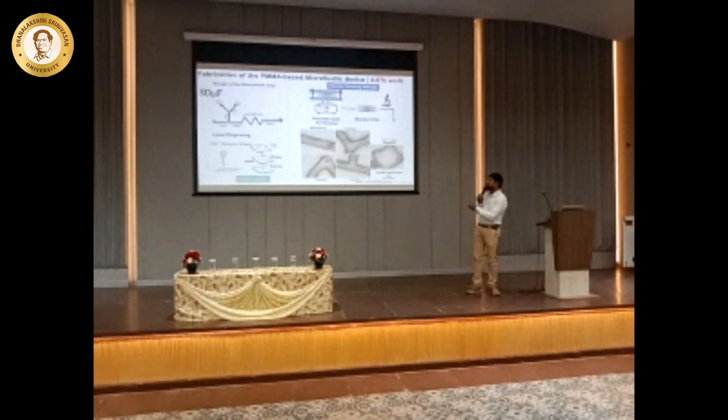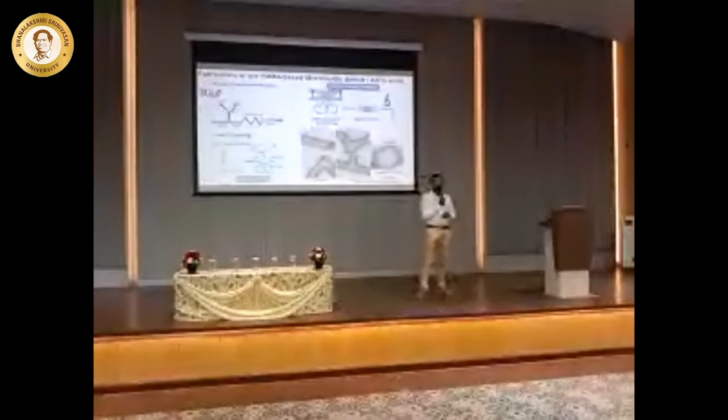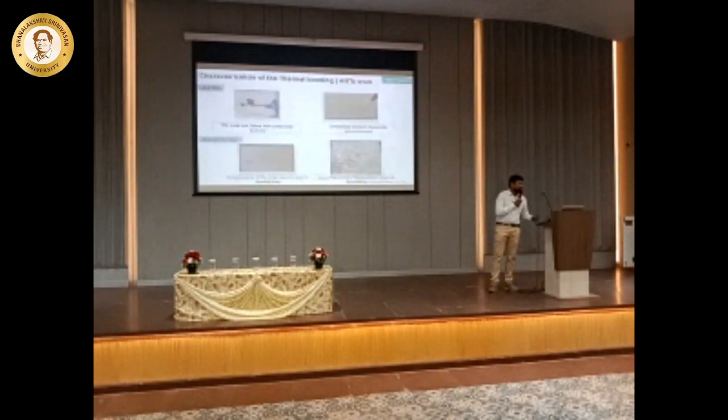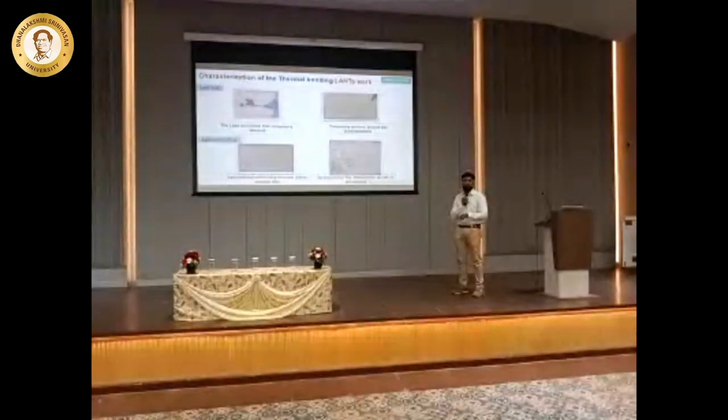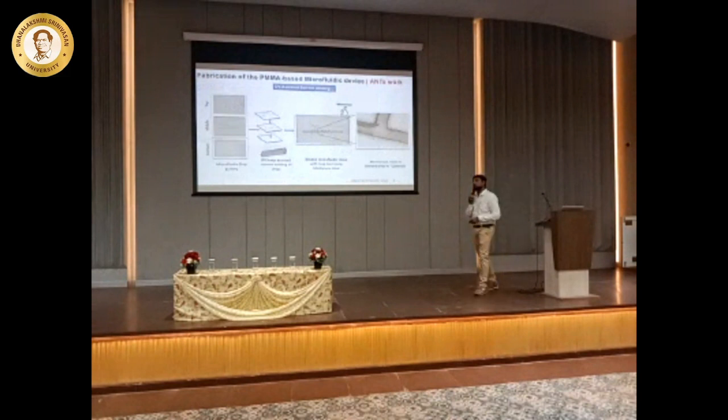See, you can see there is a lot of corrugations here, and these corrugations have happened just because of the heating that is given on these microchannels. Though we have got almost like say 250 to 500 microns, at least one dimension in the micron regions, we have found there are a lot of problems that take place when fluid interaction takes place. We are also not able to see through it, because PMMA is transparent, but I'm not able to see transparency when I use a heating environment here, and we could see a lot of leakages because the heating is not proper. All these things came into the picture when we used these thermal bonding based methods. So what we did is we finally moved on to a solvent based method.